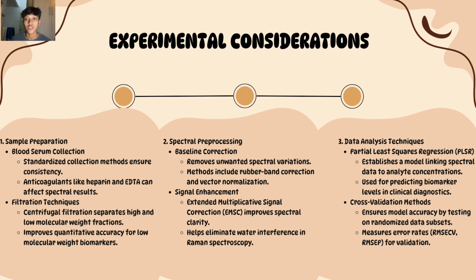I will go through the presentation for the next part. Here are the experimental considerations. There are three things that we need to consider in the experiment. The first one is sample preparation, which includes blood serum collection and also filtration techniques.